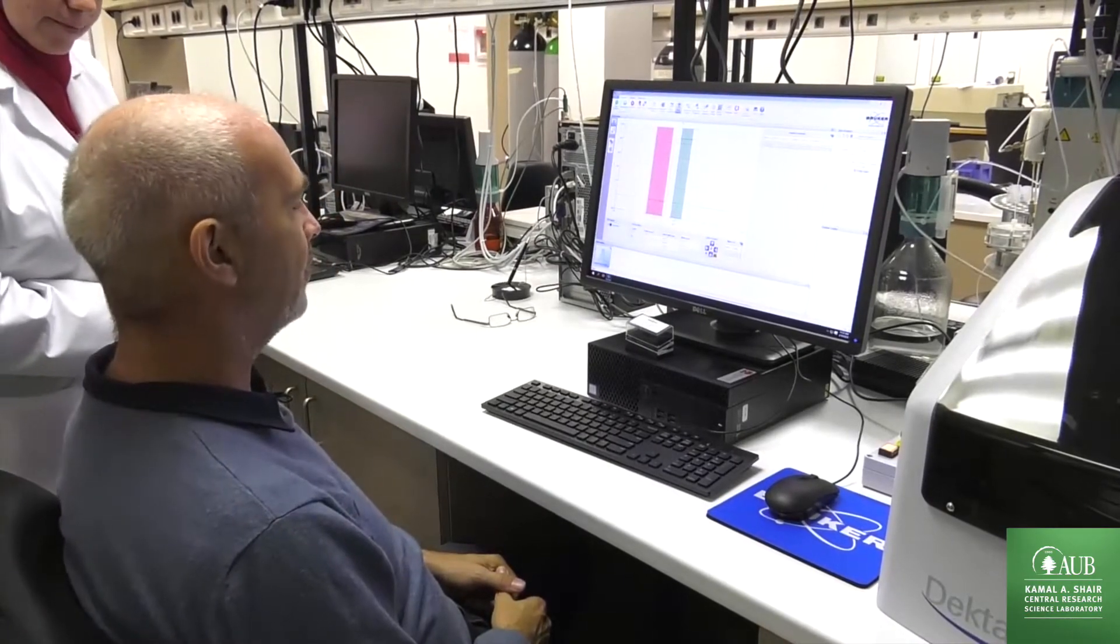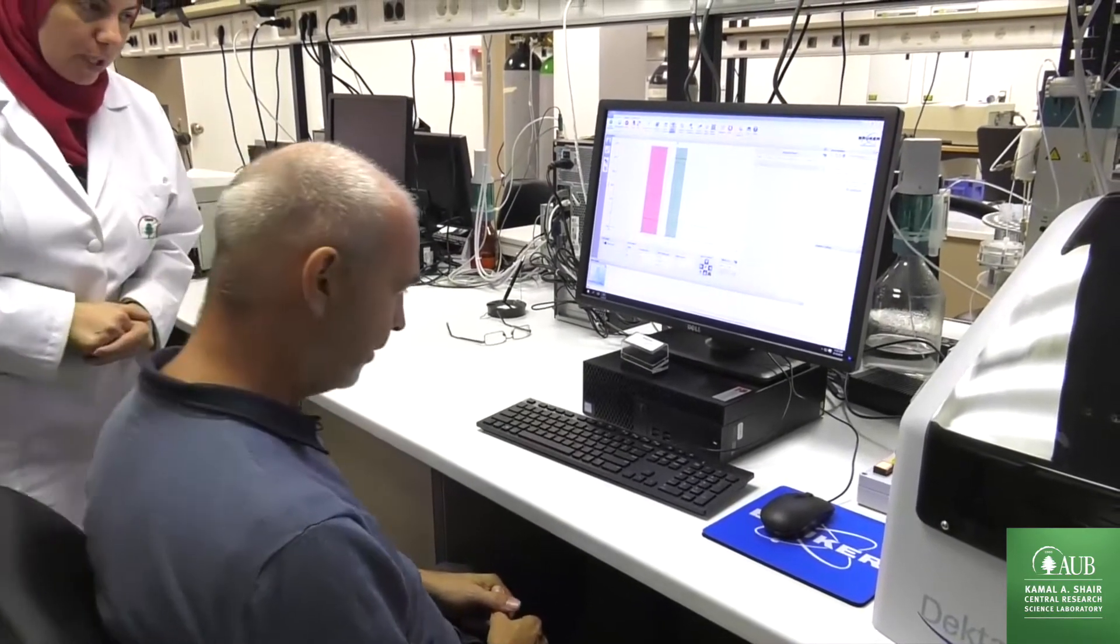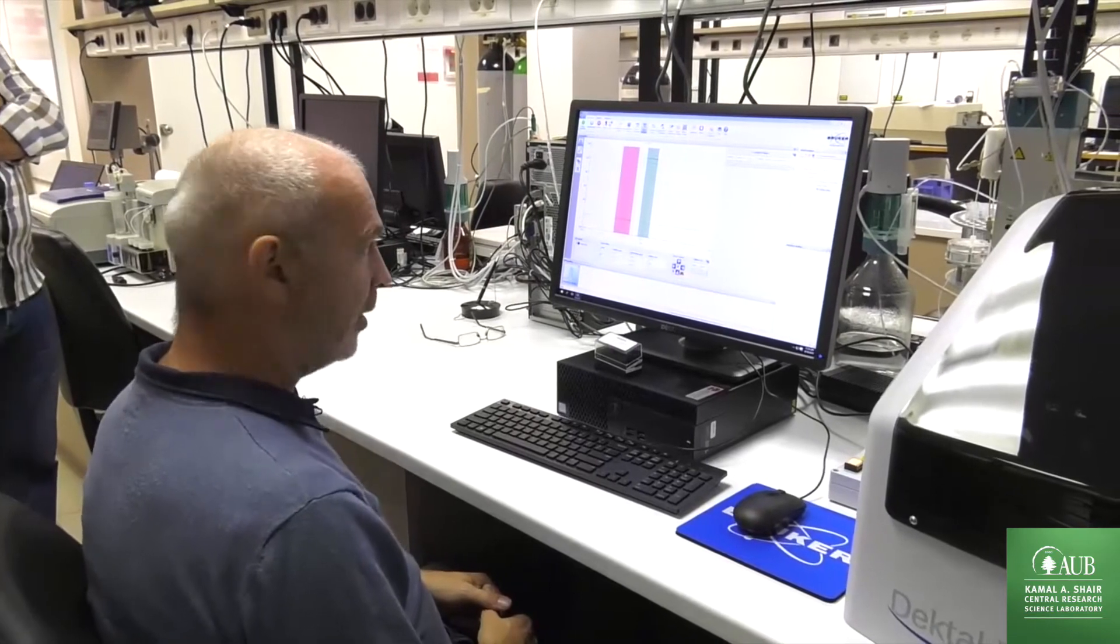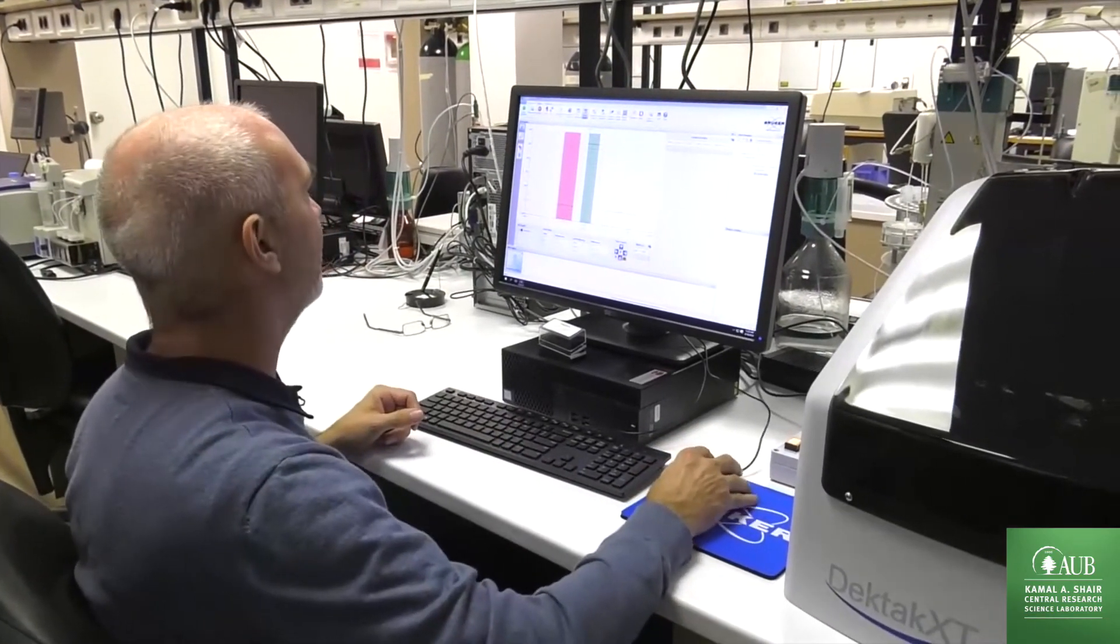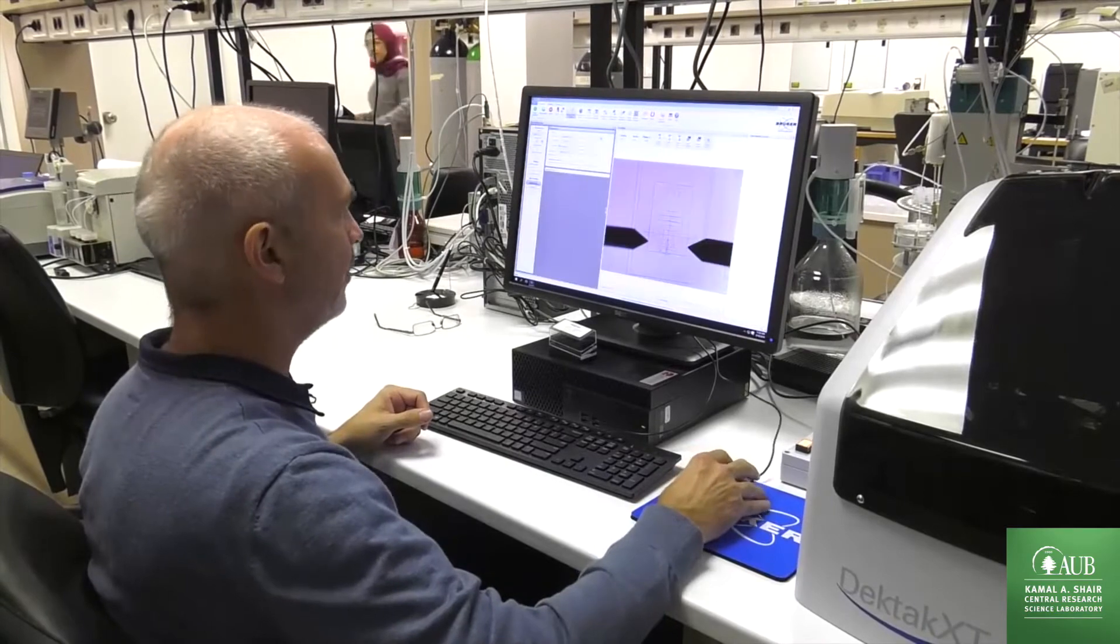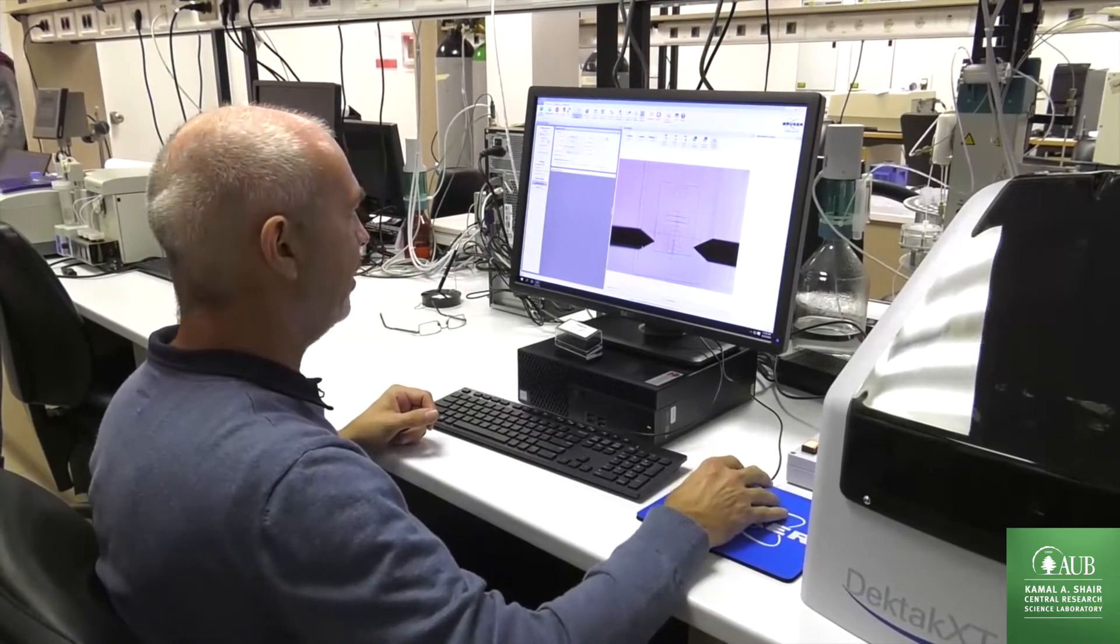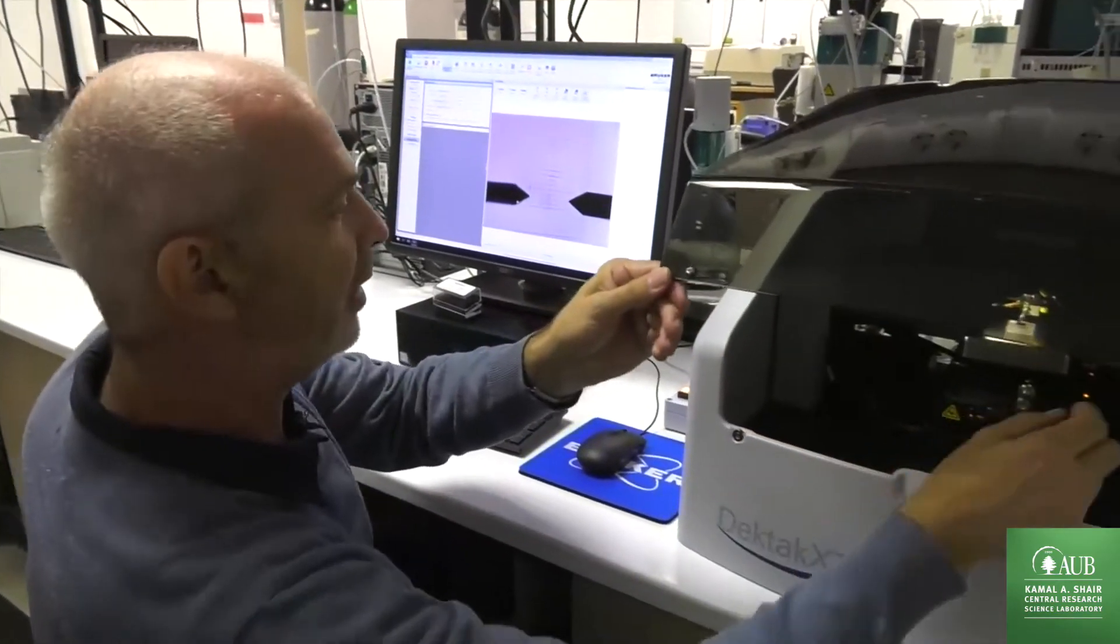Roughness as well. Now we need a different sample. We can try to measure the roughness on the silicon.